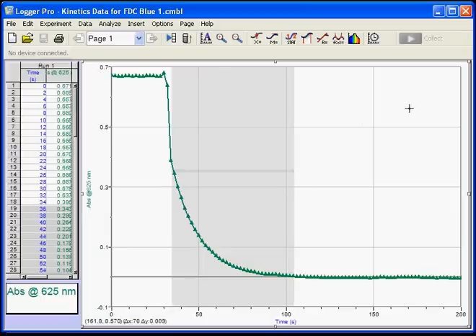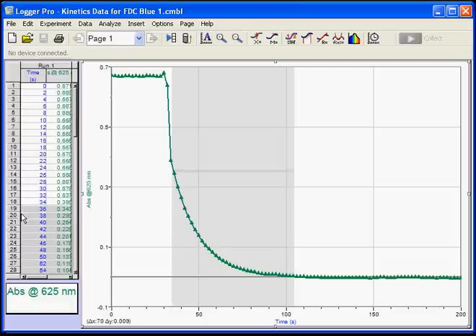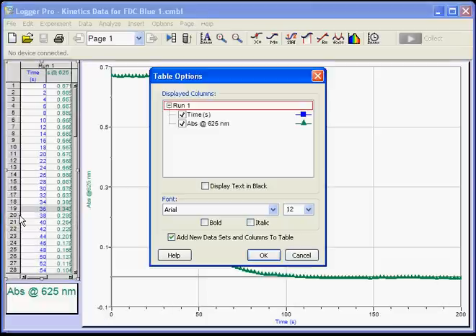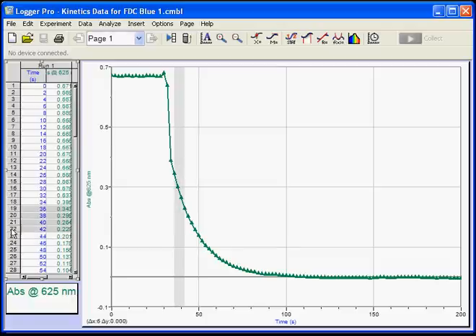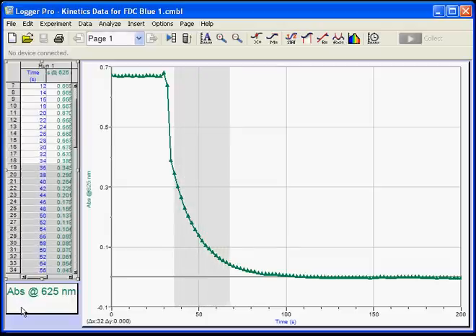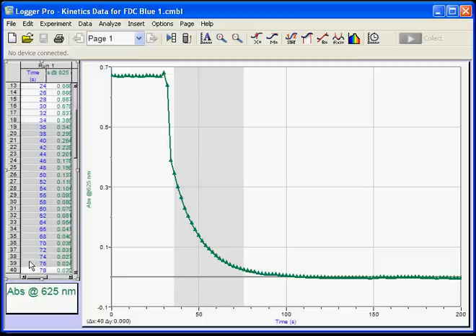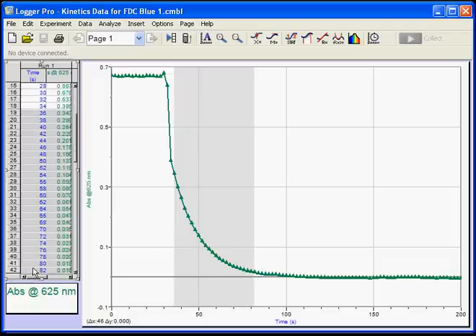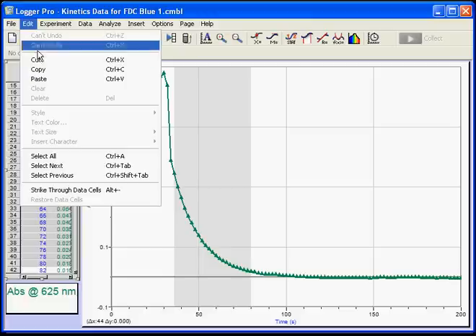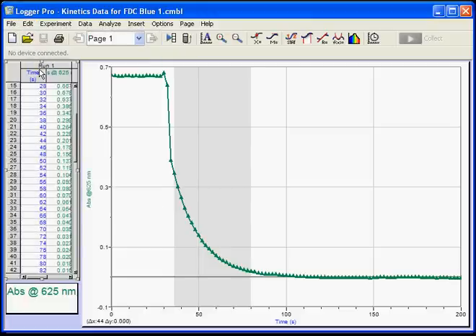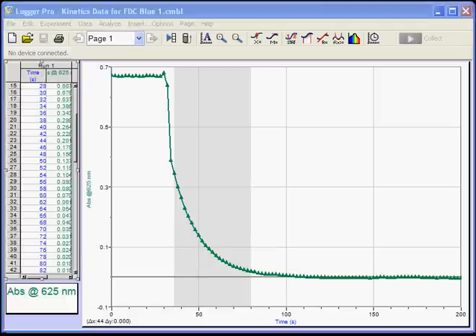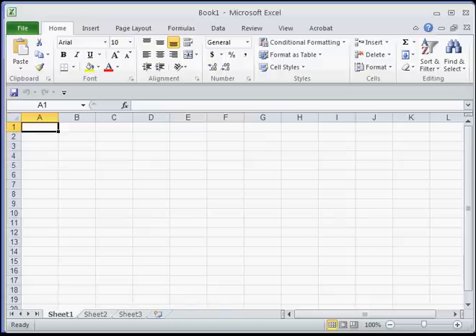So what I want to do is not, I'm highlighted in the graph right now. I don't really want to take that data. I want to take the data actually from the spreadsheet. My mouse tends to double click. That's around 0.19 in this case. And then I'm going to drag down, and I want to get, again, the usable region of the data is probably around there. So I'm going to copy that. And you can use shortcut keys. I'm just doing the menu commands because that's what everybody's familiar with.